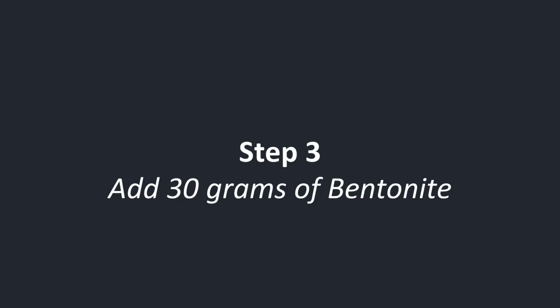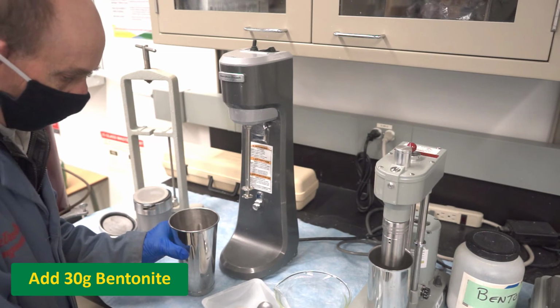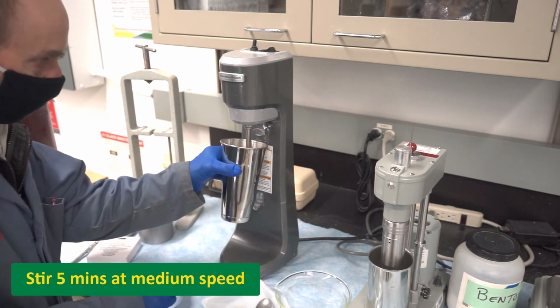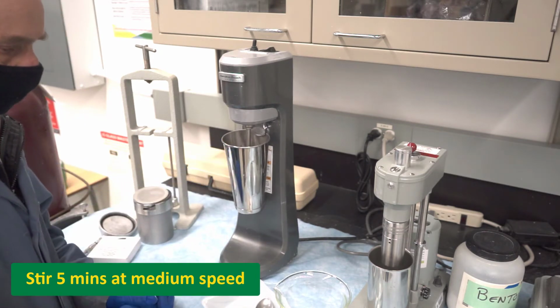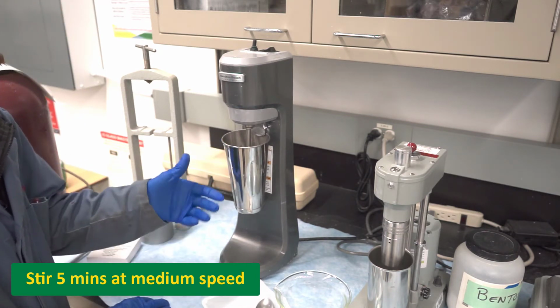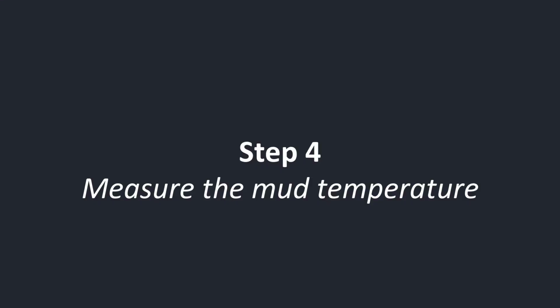Add 30 grams of bentonite while mixing. Make sure to add the bentonite slowly. Stir for 5 minutes at medium speed. Ensure that the speed isn't too high, as this might cause the mud to spill out and result in loss of sample. Measure the mud temperature.